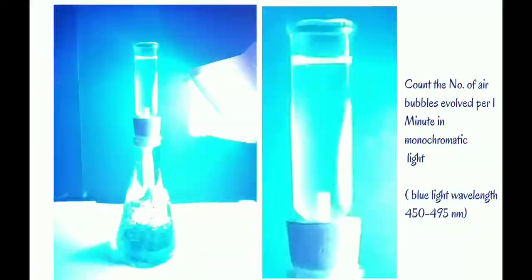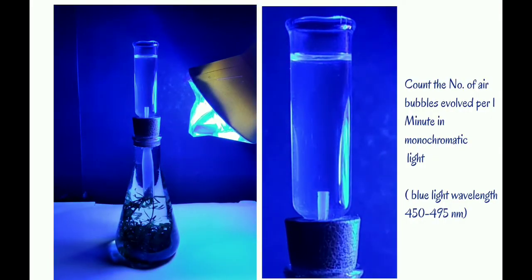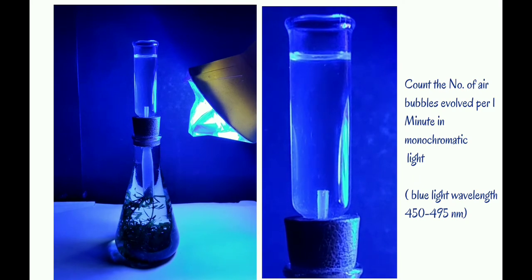The third setup, which is monochromatic light of blue light wavelength 450 to 495 nm. Observe the number of air bubbles evolved per 1 minute.